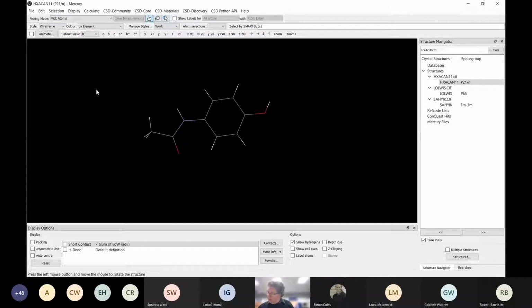So we go through most of these. If you haven't got a toolbar, we find them in the display. So there's a listing of all the toolbars. Whether we need all of them, if you're interested in some of the extra things, I believe these are the default options. But as I say, the vital ones, if you don't have the picking toolbar, sometimes things can go horribly wrong. And the same with the display options down here.